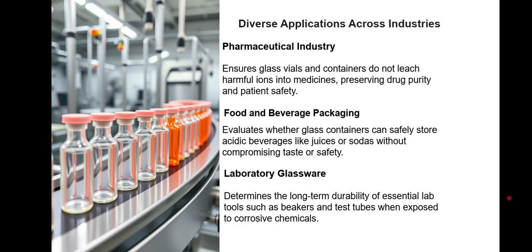And now let's explain the applications across the industries. This test has a wide application in critical industries. For example, in the pharmaceutical industry, it ensures that vials and ampoules don't contaminate the drugs. In food and beverage, it tests if bottles or jars can safely hold acidic drinks like soda or juices. For laboratory glassware, it confirms that beakers and flasks can handle strong chemicals without breaking down. In all these cases, acid resistance ensures safety, purity, and durability.